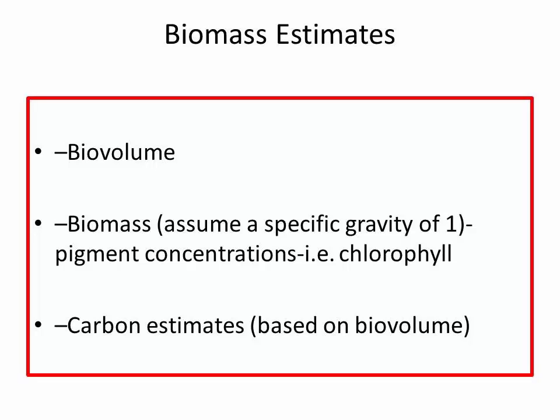The reason you might need it is that you could have a fairly small organism that's the toxin producer, and if you just did cell counts, you might misrepresent the totals in terms of total cell counts, what was there contributing to the toxicity. So sometimes biovolume is important to have. And as you saw in that RFP from the city of Salem, they wanted biovolumes.